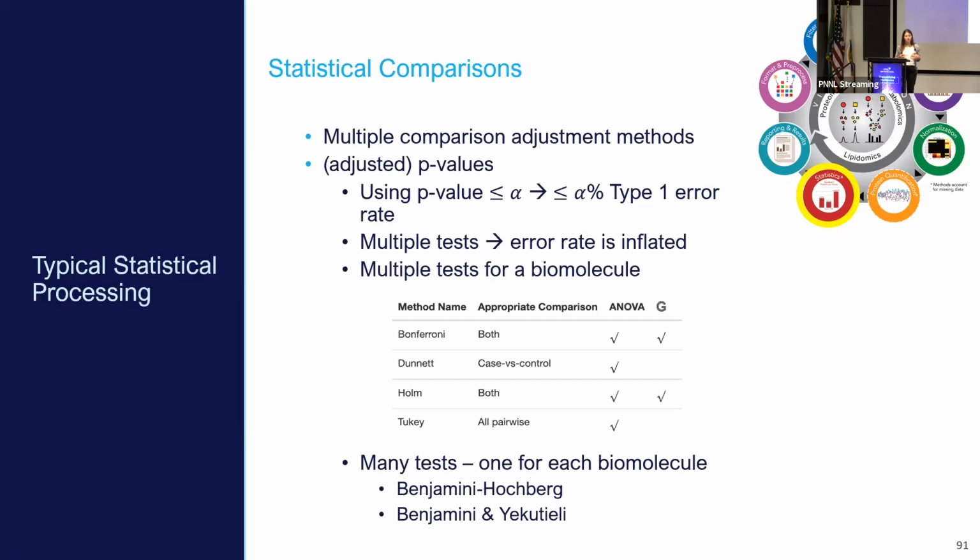And for discovery studies, we typically don't adjust because we're just trying to see what those top most interesting proteins are. But if you're trying to do statistics for an exploratory study or something like that, then these adjustments become a lot more common. So just something to keep in mind, and consult with a statistician if you have questions, or the literature. This topic in particular, there's lots of information available.